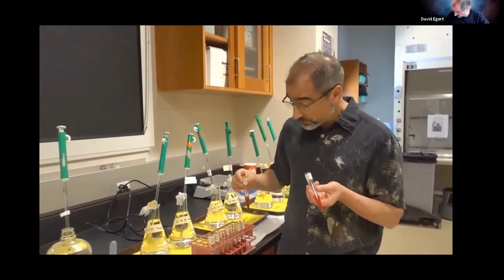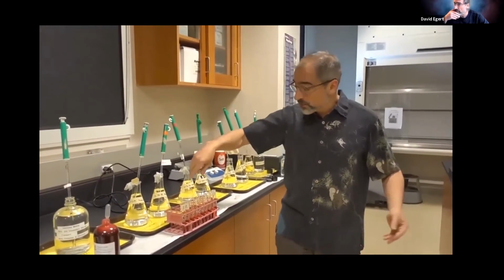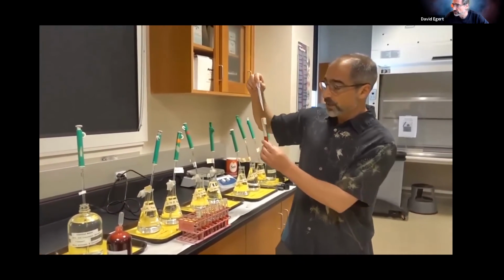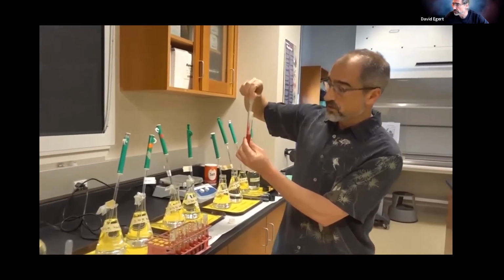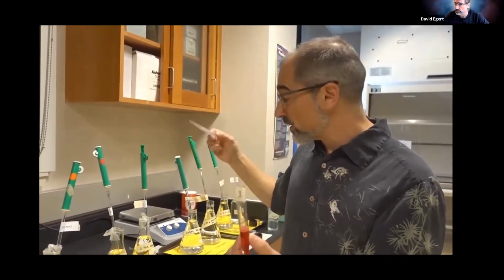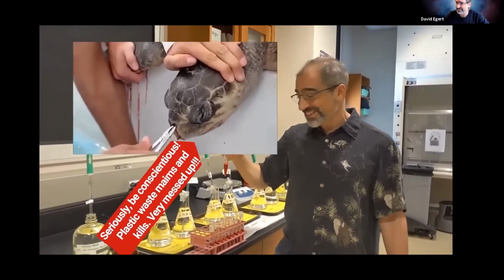the results. So again, we actually have 2 versions of 9. And the next step is going to be to make sure these are well mixed. If they don't look well mixed, you can just use a clean pipette, and really make sure they're all mixed up well. And then obviously you're not going to use this for anything else anymore because it's going to cross-contaminate. So this is plastic waste. Hopefully it doesn't poke the nose of a turtle in the ocean or something.